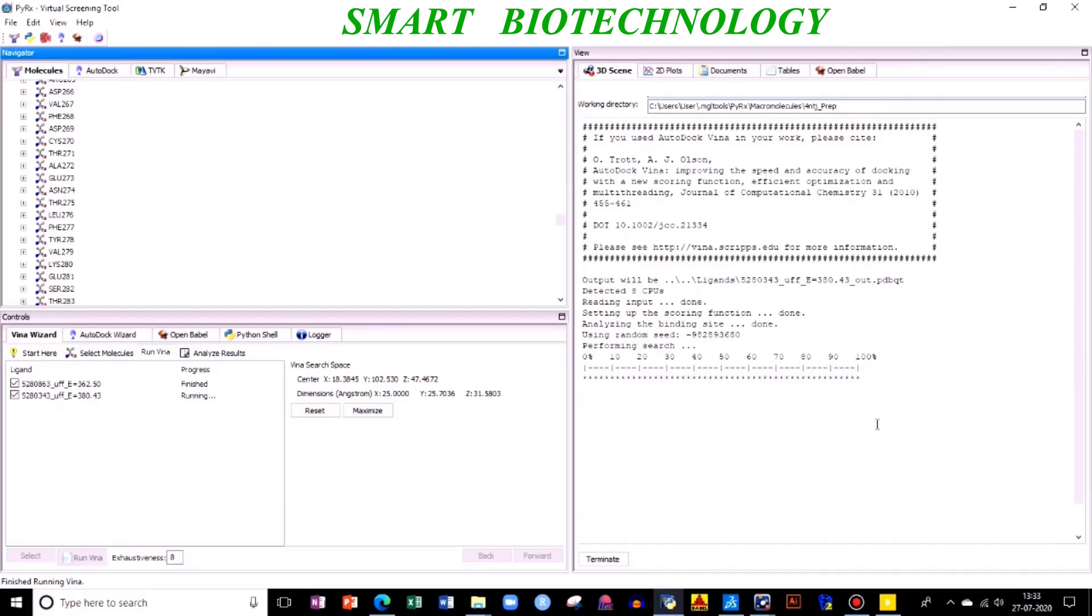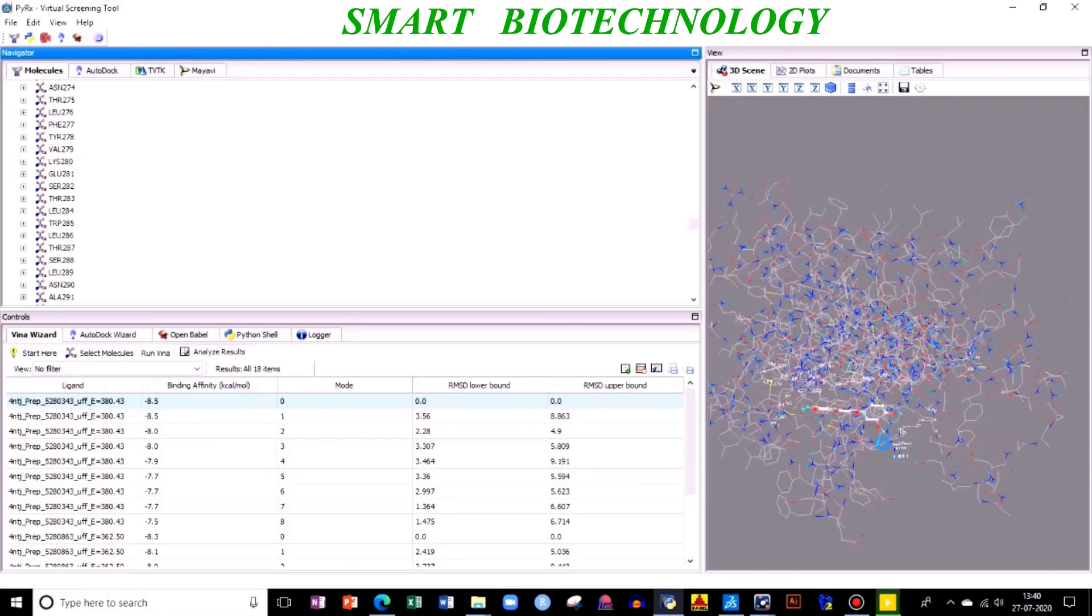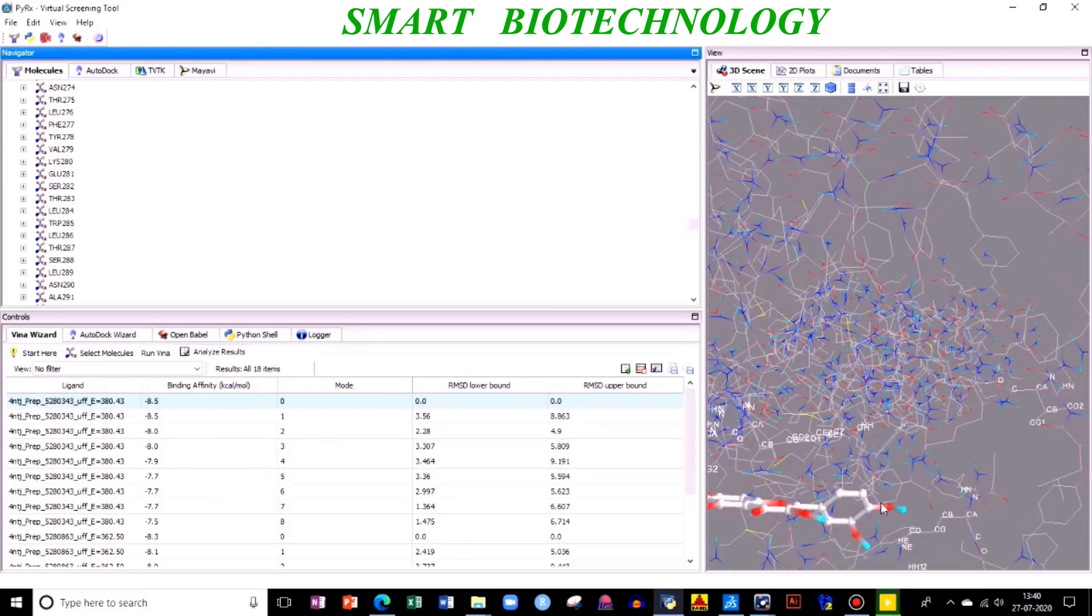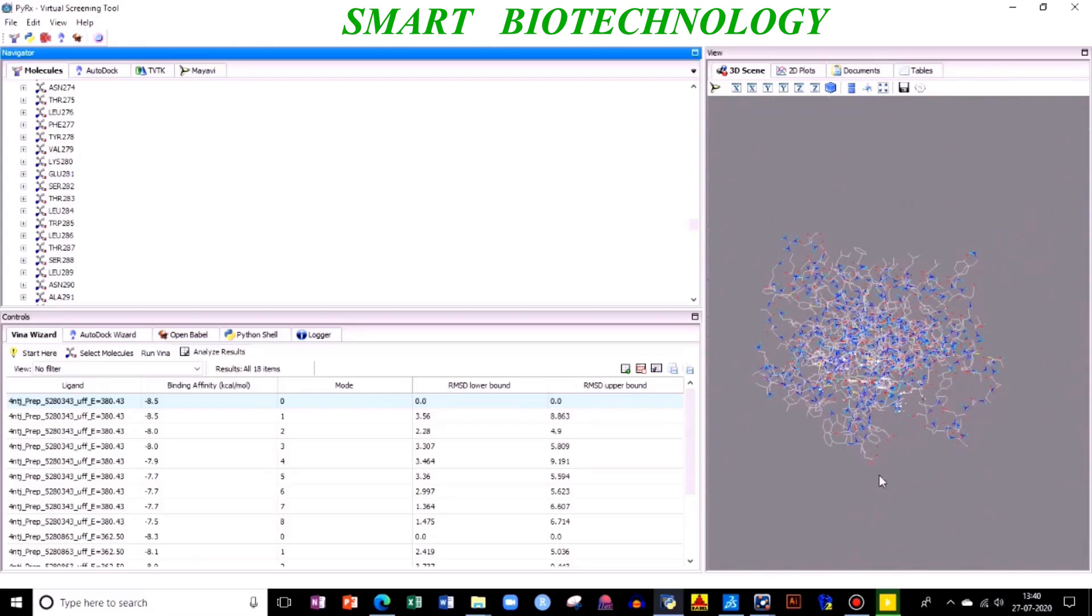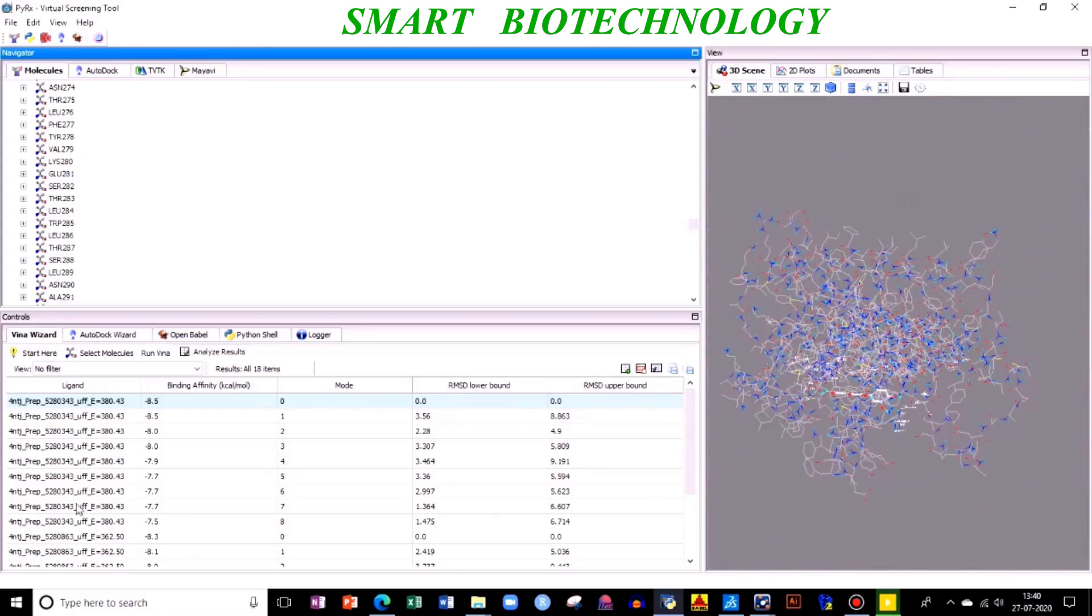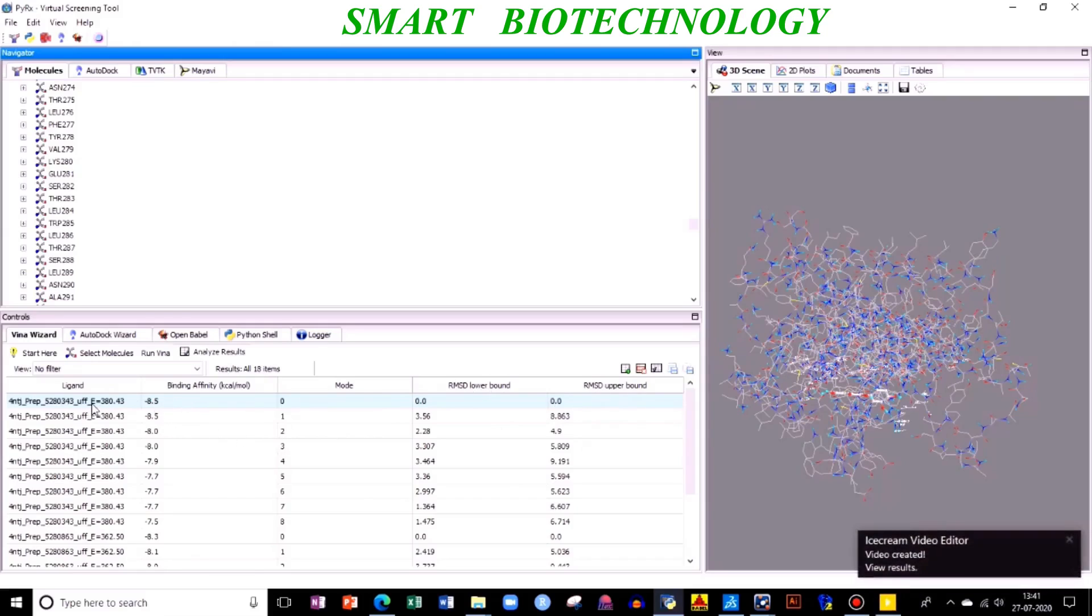I think this will be finished right now. Docking is done. Like the screen, you can see, and here you can scroll and see your docked ligand with your protein. Now you have different parameters here. You have binding affinity which is very important. You have mode, RMSD - root mean square deviation.